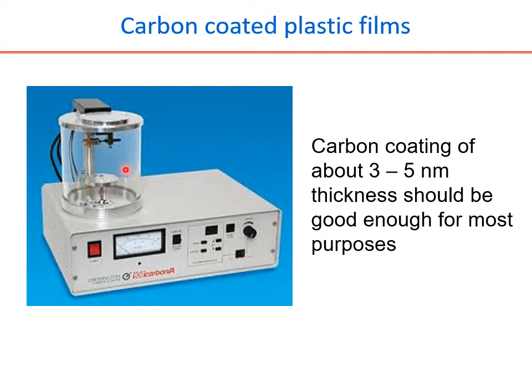So having said that, then the good laboratory practices. Once the experiment is done, before you leave, remember the carbon film is not just deposited on your grids alone, it will be deposited everywhere else. So before taking away your grids and walking away from the instrument, it is your responsibility to clean everything else and leave the bell jar and the surroundings inside this bell jar in a clean shape. So it is not just use the carbon film and go away.